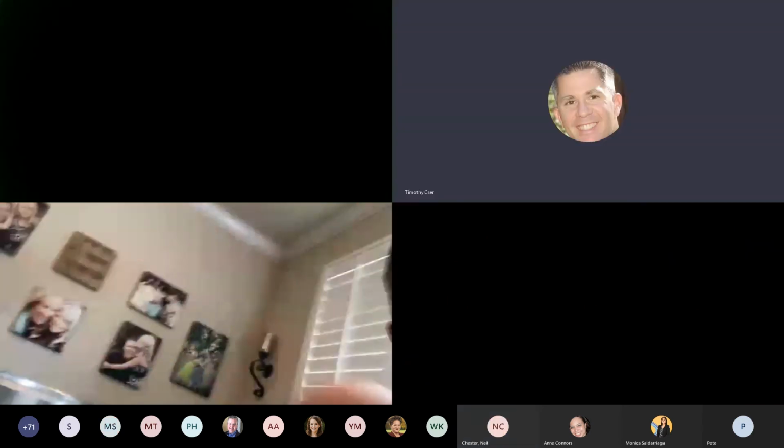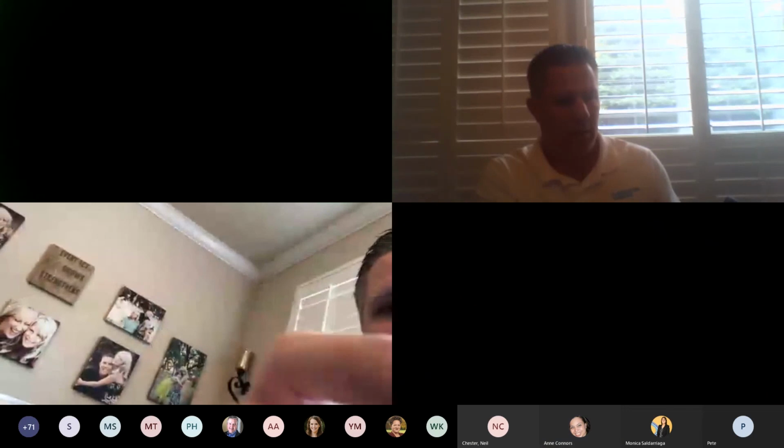So with that, I'm going to stop the camera. We do have a question, Tim.